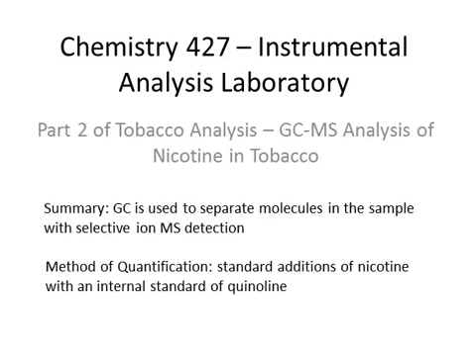And this allows us to determine the quantity of nicotine within the very complex matrices that we are working with. We'll use an internal standard of quinoline to help get rid of the natural variability in the samples, which will help our reproducibility and also our ability to quantify the amount of nicotine that's present. In addition, we'll use standard addition spikes of nicotine to build a calibration curve.